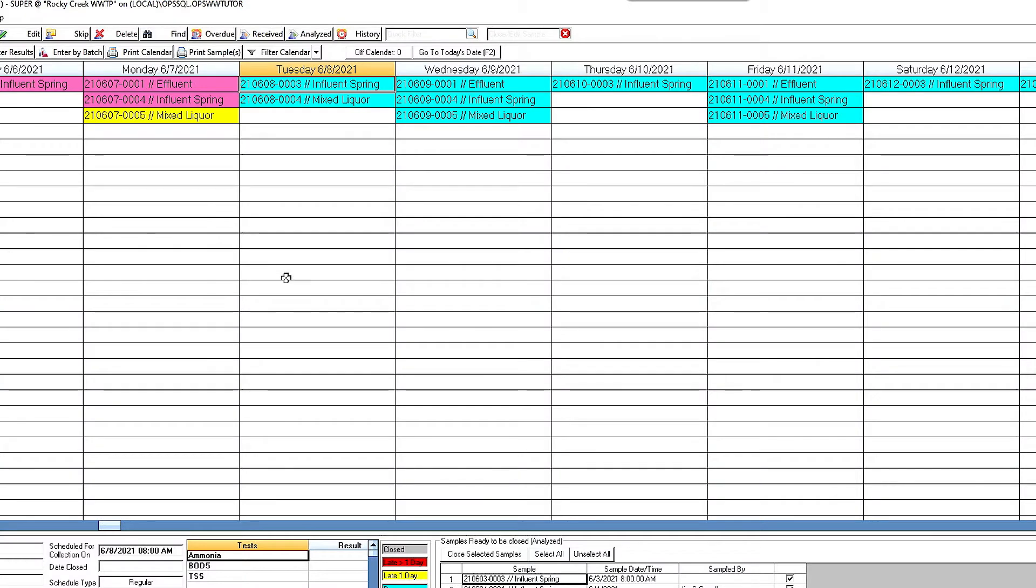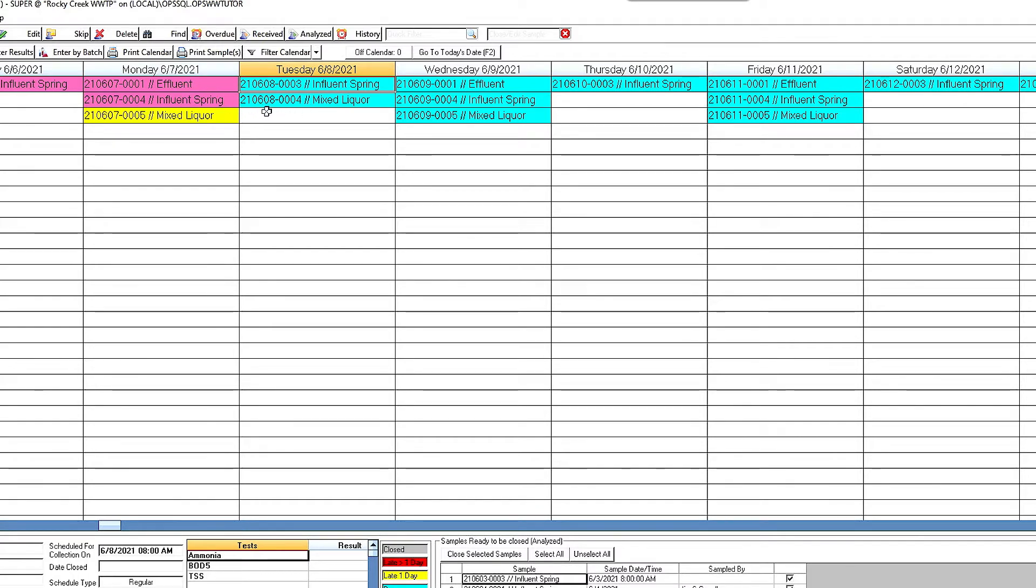So what I have is the classic calendar that we've seen. It is a color-coded calendar, and it shows these samples are due today. That's that blue color. The yellow one is overdue. This pink color means it was received yesterday. So I'm just going to take you through a normal workflow.